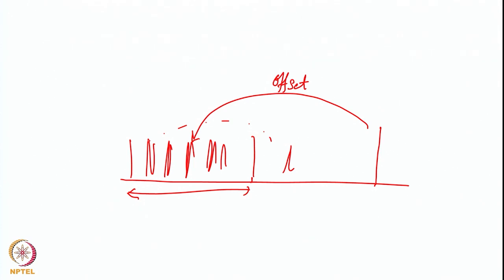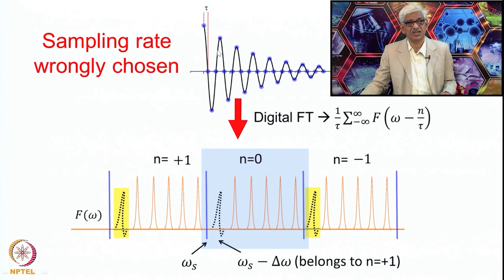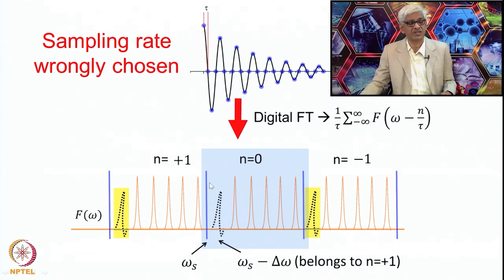How does that happen? This happens as a consequence of the digitization theorem. The noise will also fold, which has another consequence we will discuss shortly. If the sampling rate is wrongly chosen — you place the offset somewhere, choose your spectral width wrongly, collect the digitized data, and do a digital Fourier transformation — then it is a consequence of that digital Fourier transformation that you get lines to fold.